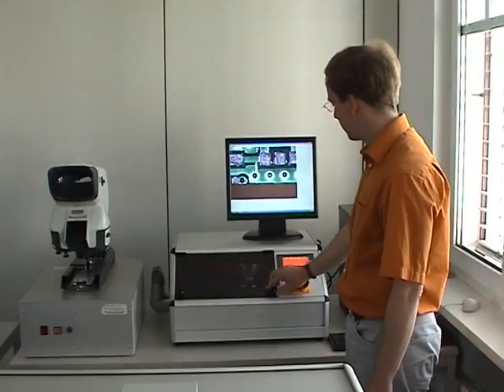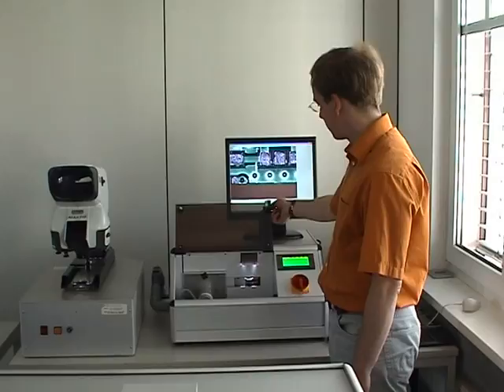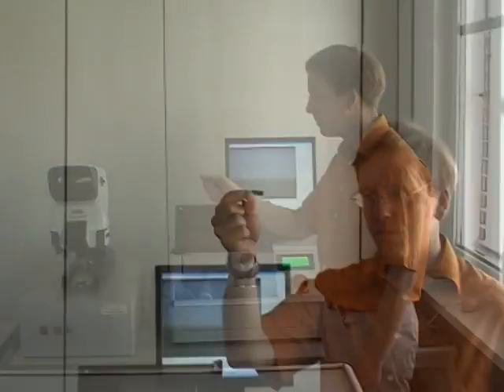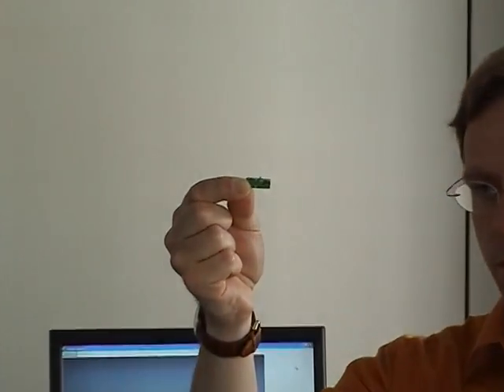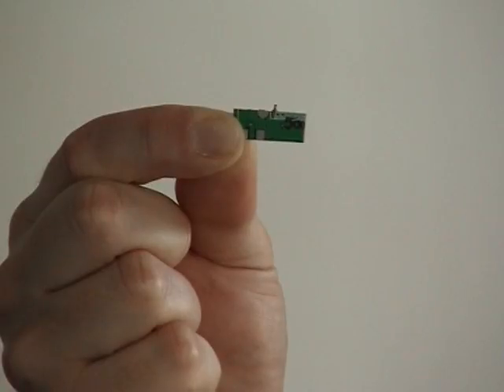Now the specimen can be taken out. The hole, which we are interested in, has now a defined distance to the edge.